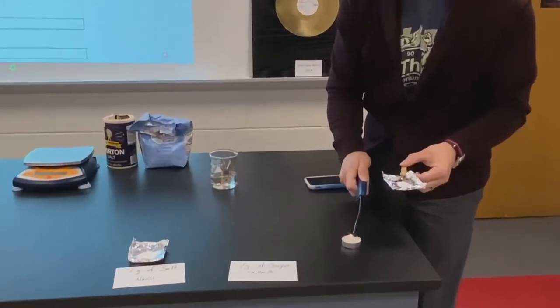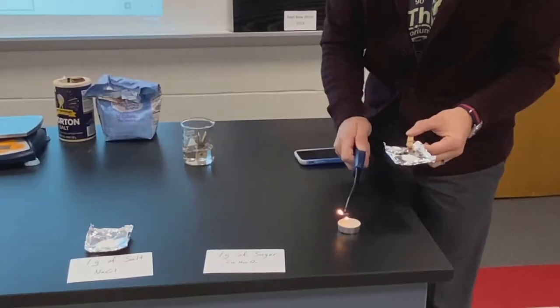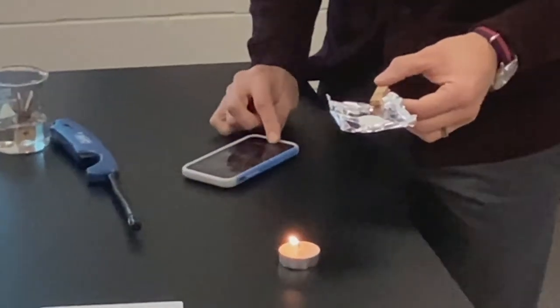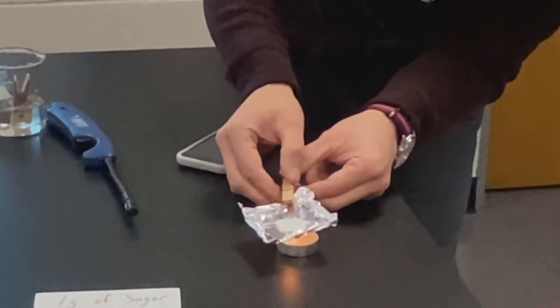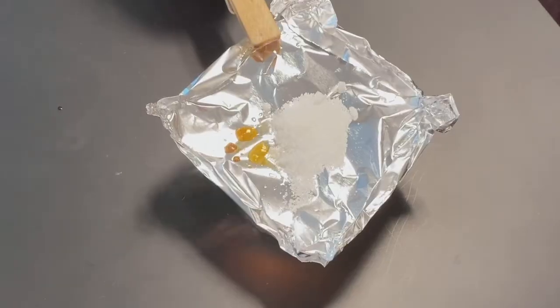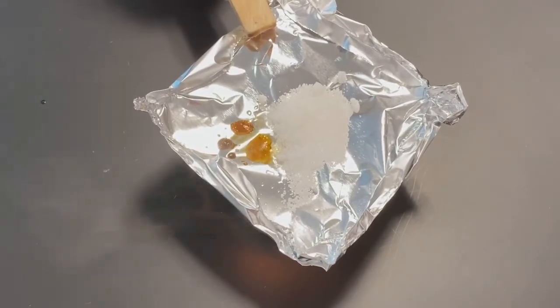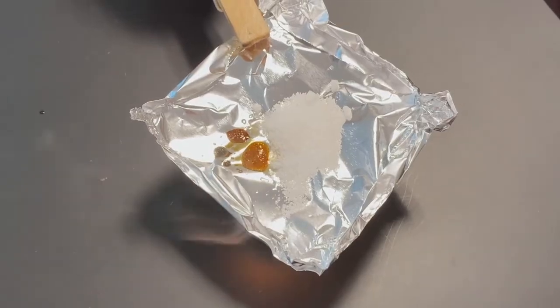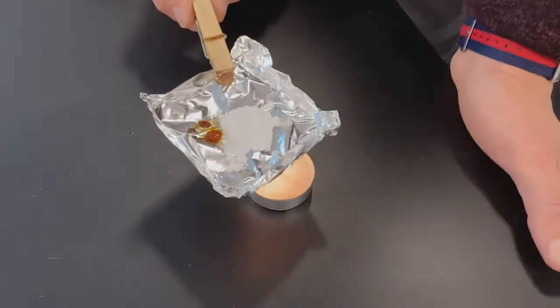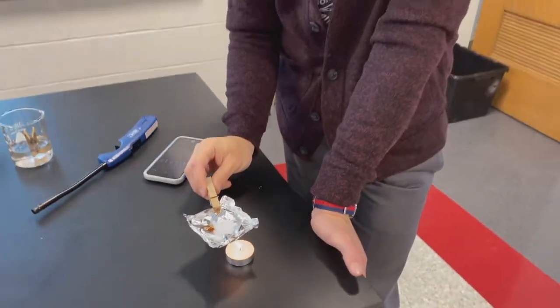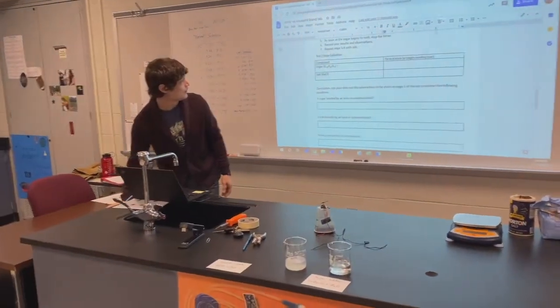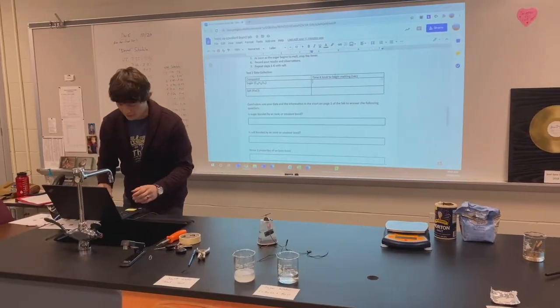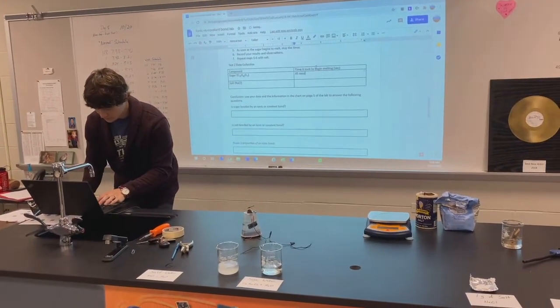This one is sugar. Light my tea candle. I'm going to start my timer as I lower it down onto the flame. As you can see, my sugar is starting to melt at about 45 seconds — it began to melt. I'm not going to keep melting it because it's going to start to burn and smoke and I don't want to set off the fire alarms. So we're going to stop at 45 seconds because that's when it just started to melt. Under sugar: 45 seconds.